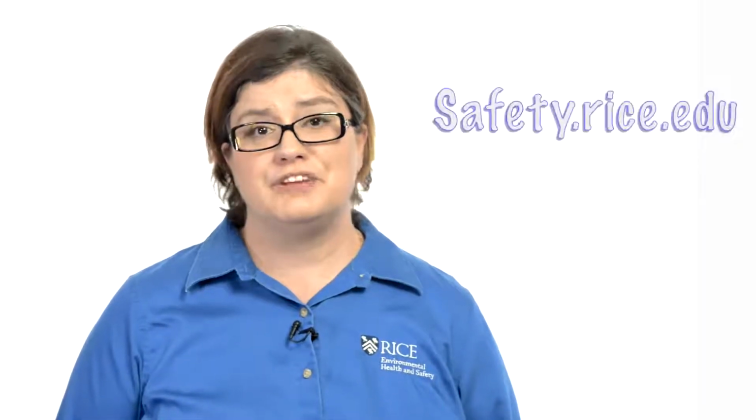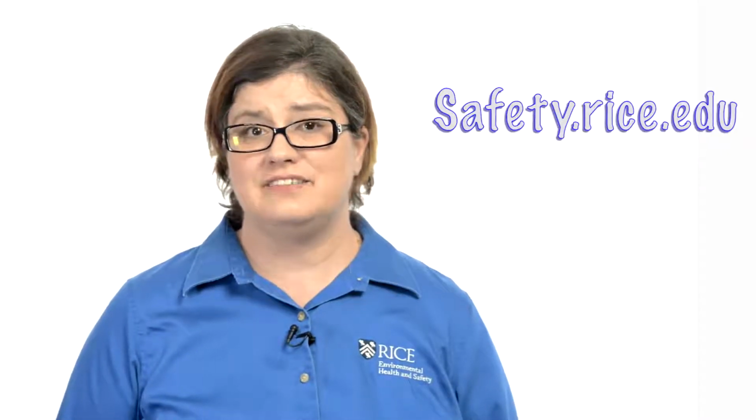After any accident, incident, or near miss in the laboratory, you need to fill out an accident or injury report form. If the person affected is a Rice employee, then we also need the employer's first report of injury or illness. Both of these forms can be found on our website at safety.rice.edu.